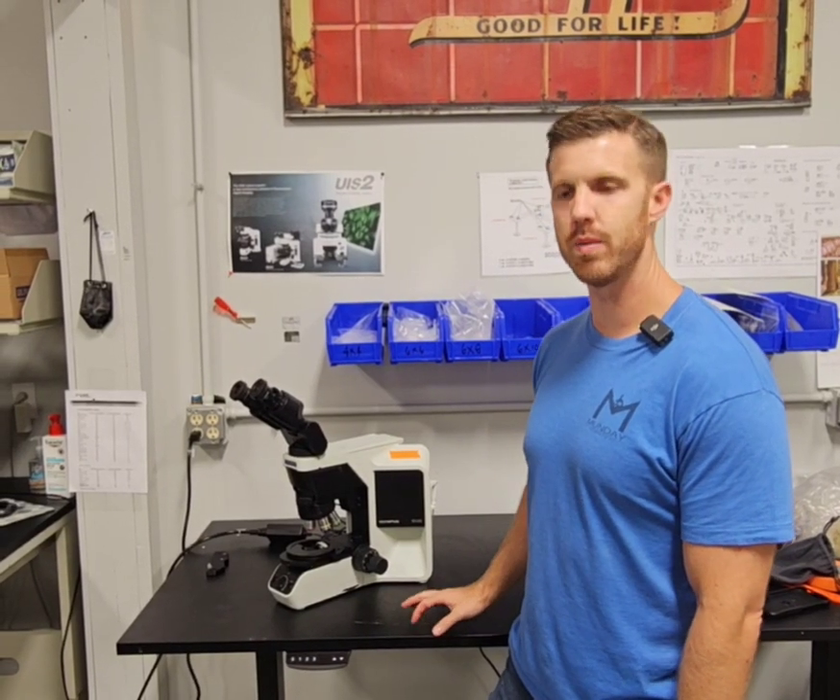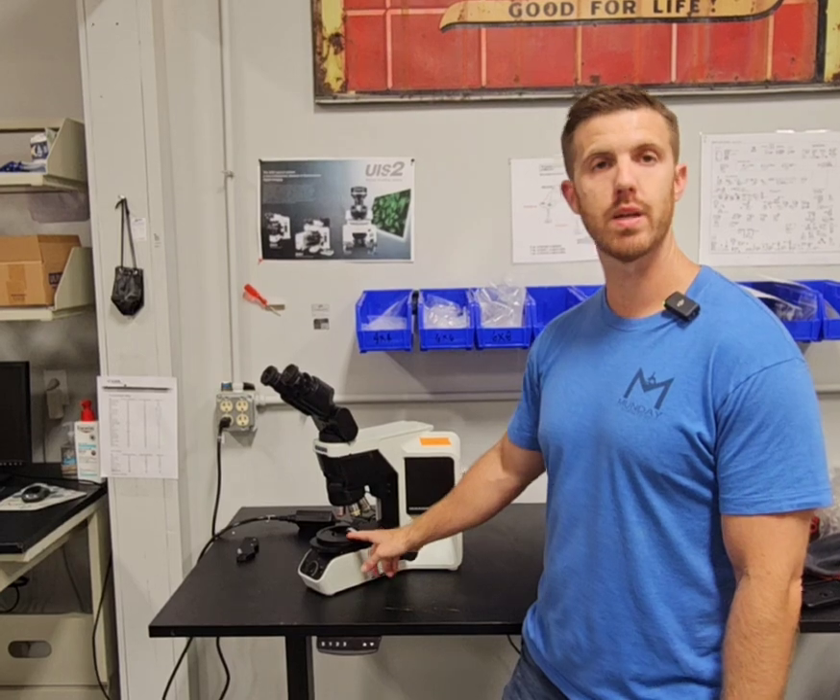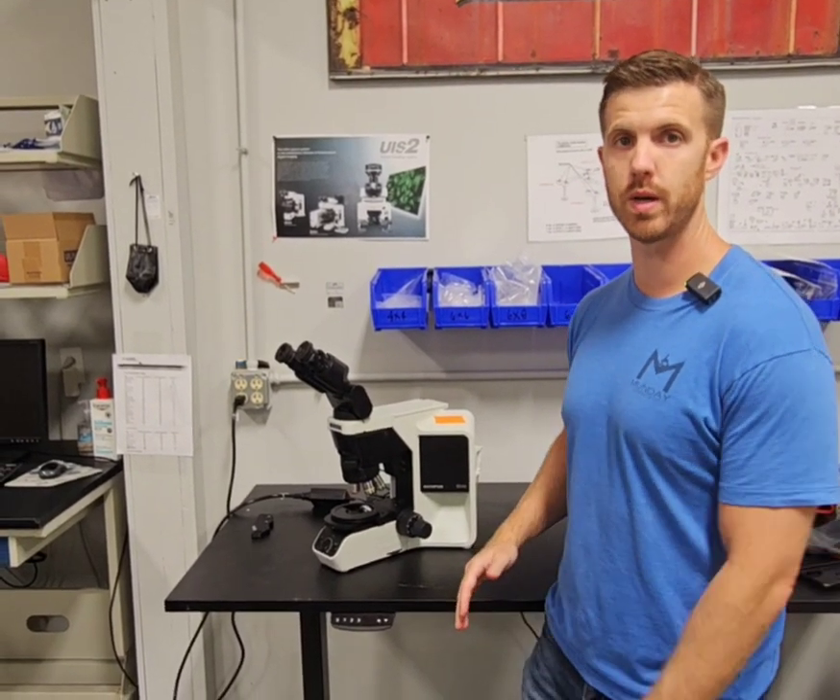Chad with Monday Scientific. Today we're going to talk about when your LED light is blinking on your Olympus BX46 or BX43 microscope.